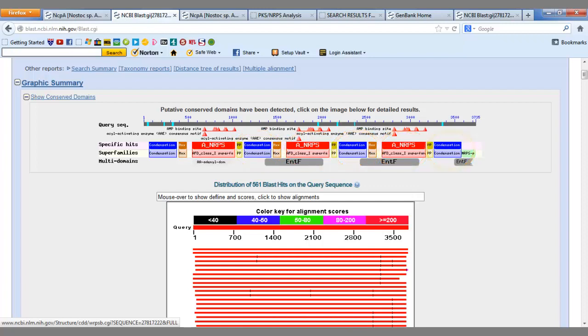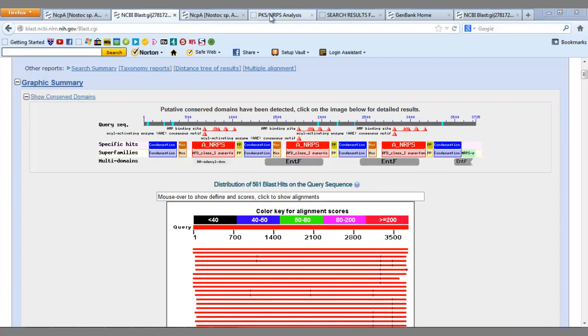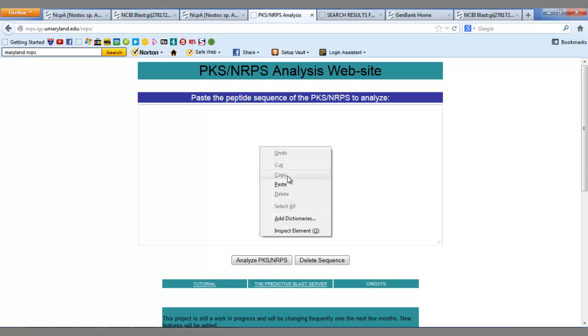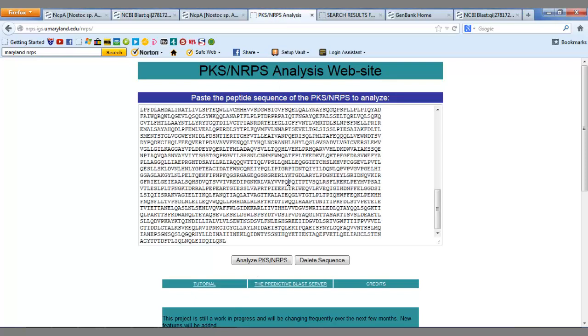However, to increase the confidence that this is a non-ribosomal peptide synthetase, we can use another website called Maryland. Maryland analyzes FASTA sequences and compares them to a known database of domains to see if any share functional similarity. So we paste the FASTA sequence of the region into Maryland to see if we retrieve any hits.